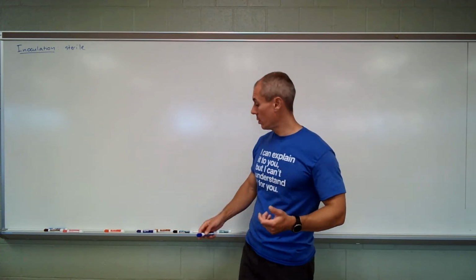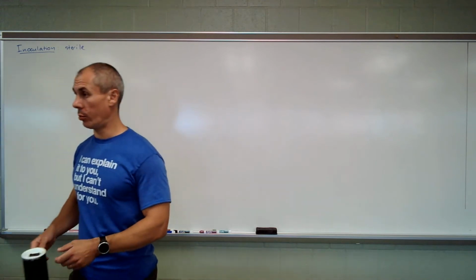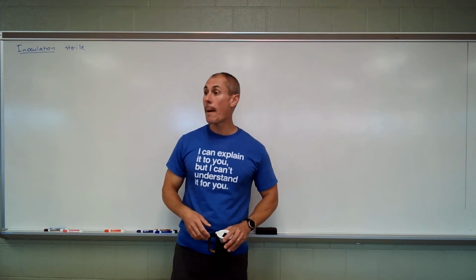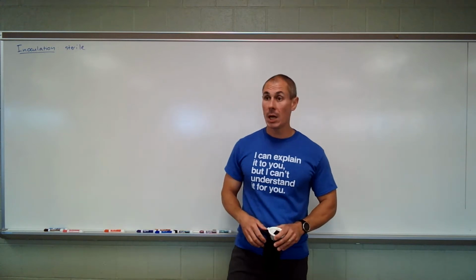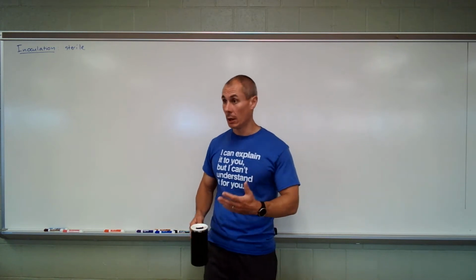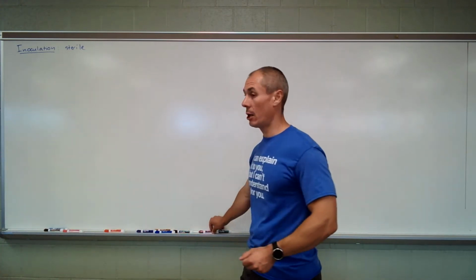This brings us to the concept of medium. So what is the medium in microbiology? Medium is anything that supports the growth of microbes. TSA, trypticase soy agar, medium. Milk, medium. Chicken stock, medium. Mice, medium. We are a medium. You can consider us medium for microbes.